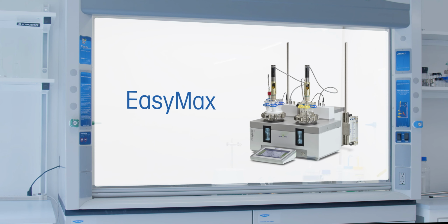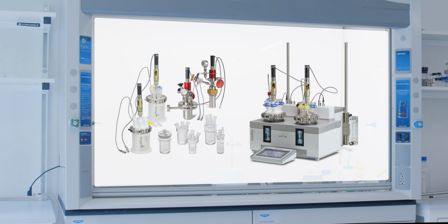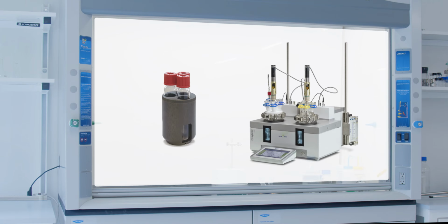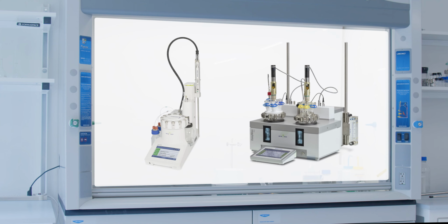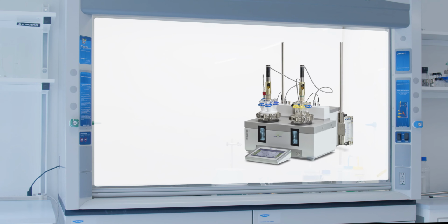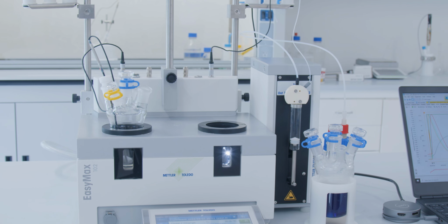EasyMax Chemical Synthesis Workstation addresses these issues. EasyMax is modular and can be set up with the components that you need: overhead or magnetic stirring, a variety of reactors, tubes and vials, automated reagent dosing, even automated sampling using EasySampler. EasyMax also makes chemical synthesis much easier, as there is no need to put together all of the pieces necessary to conduct an experiment. Everything needed is already built into the EasyMax platform.